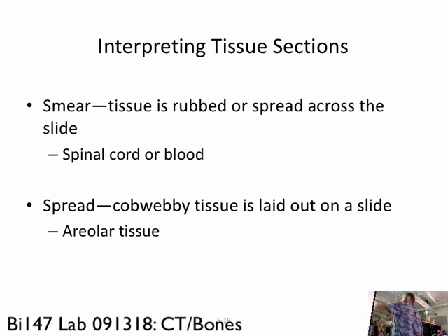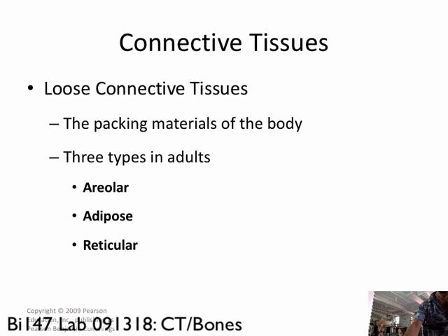A smear can be spinal cord or blood. A spread is areolar tissue, so it's like spread it out on there. Blood, smear, liquids get smeared on the glass.